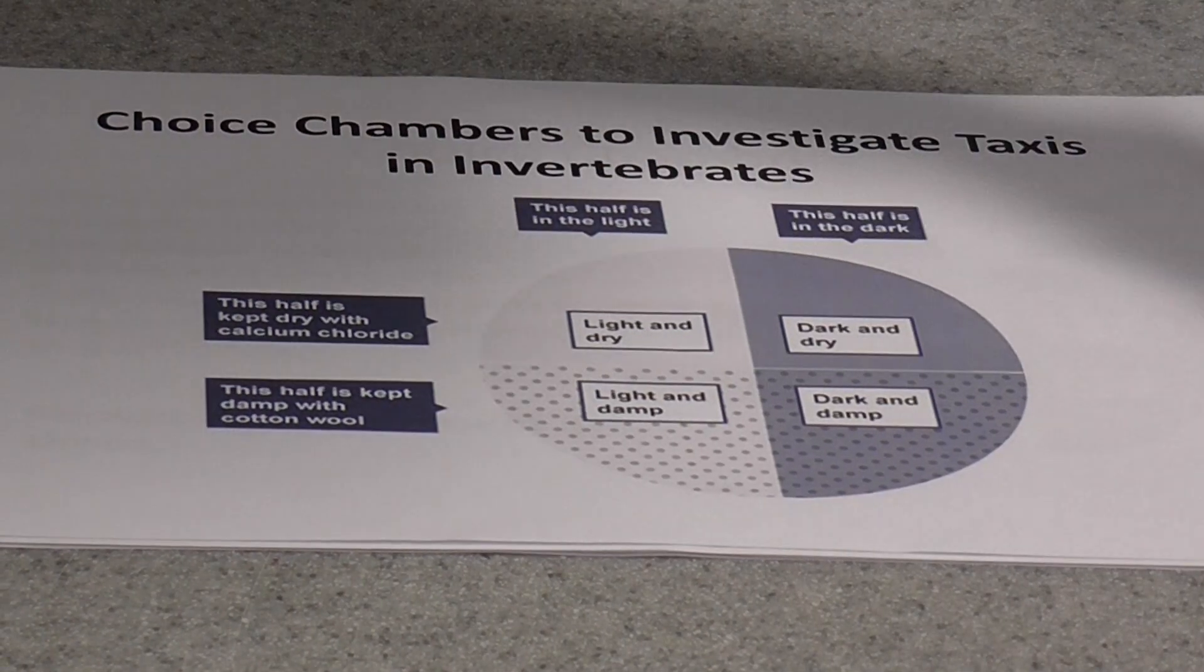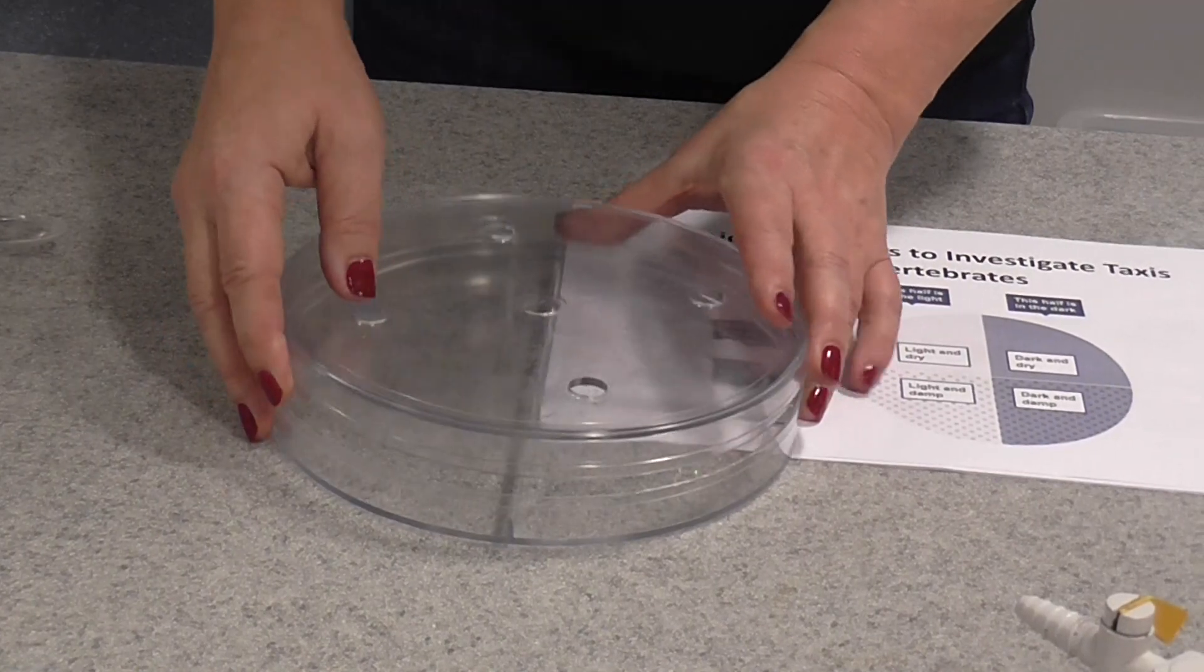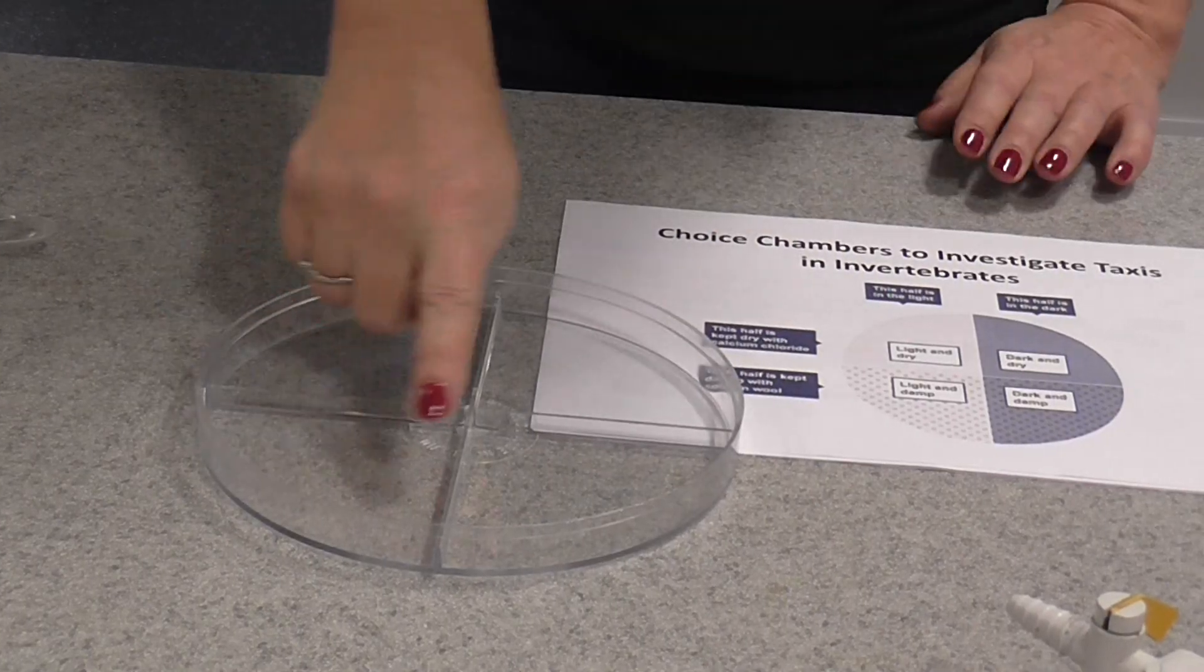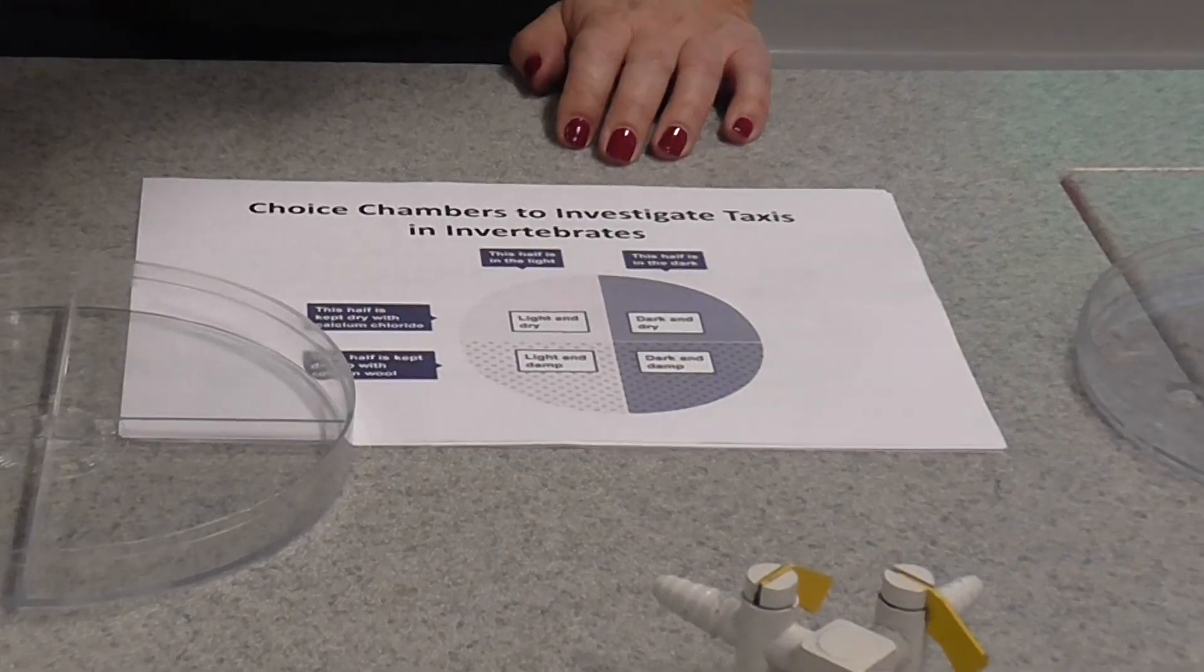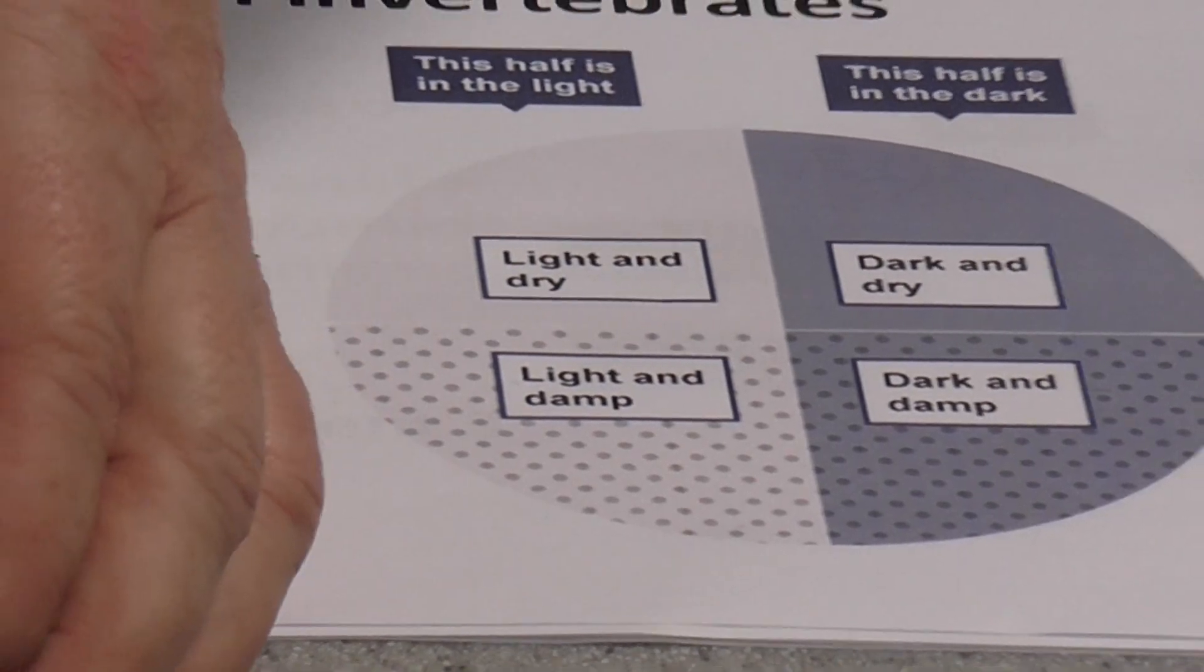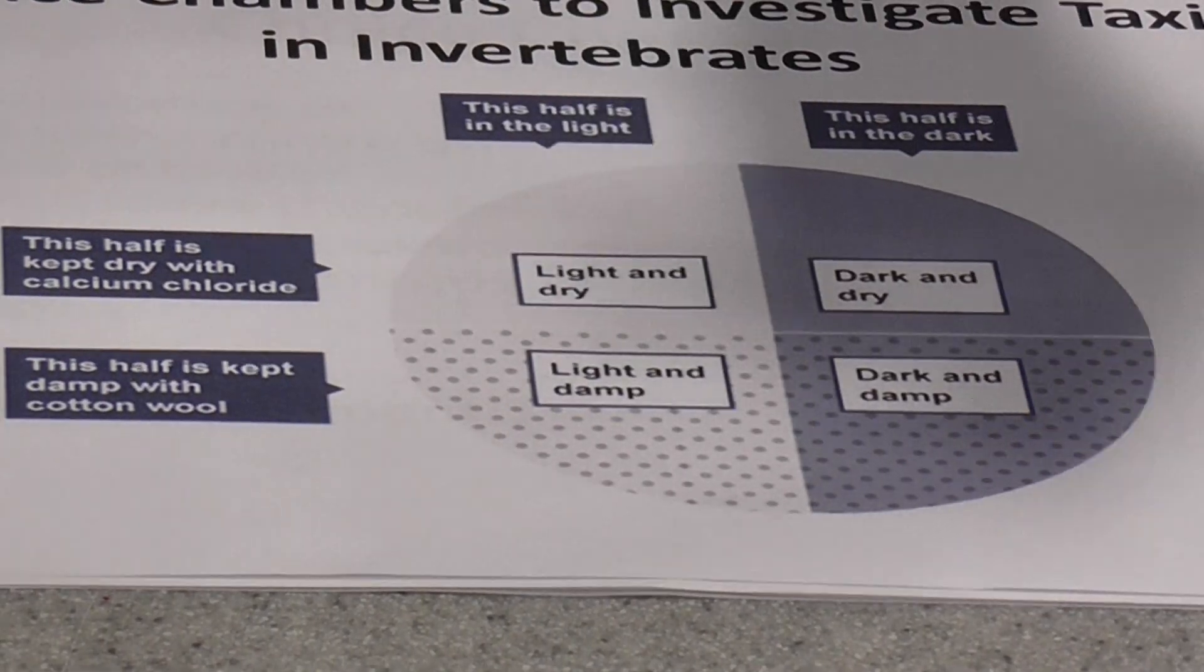Now this is a choice chamber and it's basically like a giant perspex petri dish. In the base, it's divided into four sections and the idea is that you create different conditions in these sections. Then you can place your maggots in there or whatever you're using, return the lid and you can observe where they prefer to move.